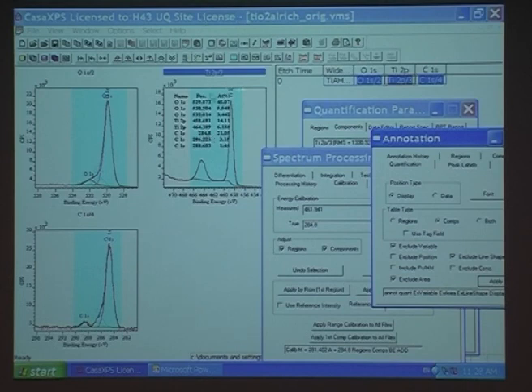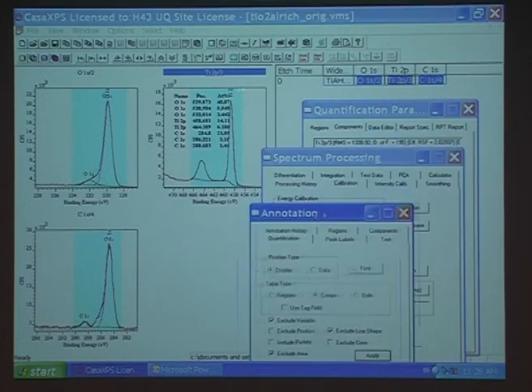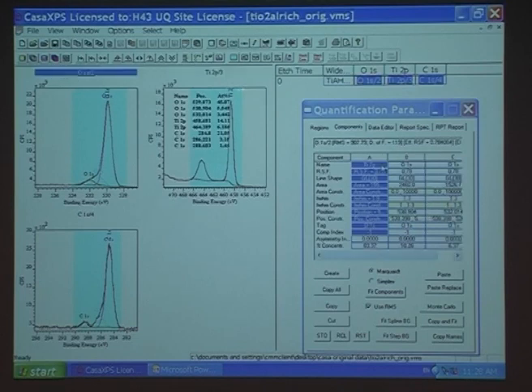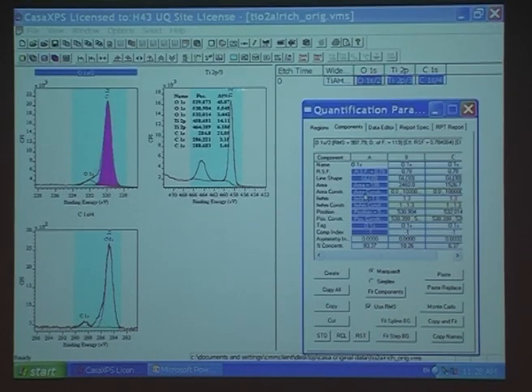And if we start looking now, if we add these two titaniums together, they're about 20 point something, and we look at the oxygen, well, it's not too bad, is it? There's a bit of oxygen here, so I can come in out of the oxygen and go through my normal, let's close that, go to the oxygen, and I say most of it is from the TiO2.